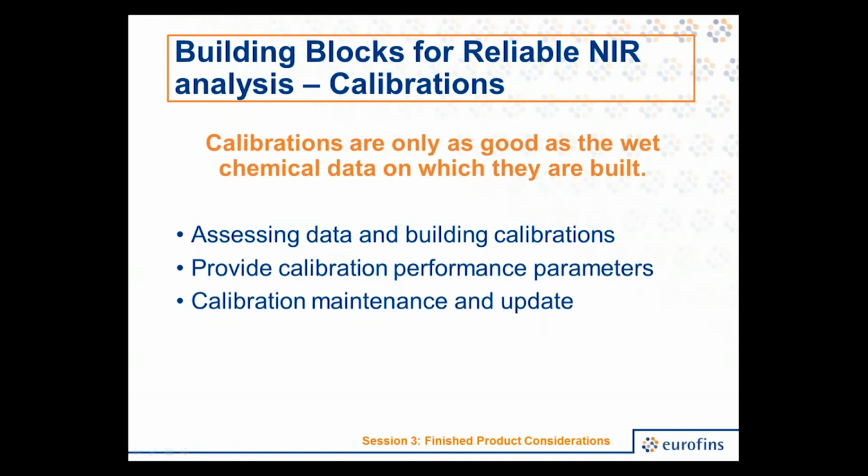Good calibration curves are time consuming, and they definitely take a specific level of expertise to develop. Once these are developed, it is difficult to consider starting from scratch as well. Instead, you can look at transferring the models to a different platform to stay as current as possible with your near-infrared program and needs.